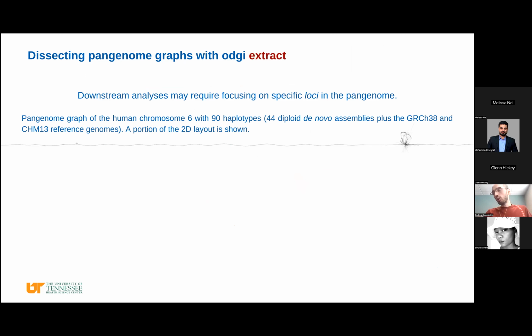We usually generate chromosome-specific pangenome graphs representing the whole chromosomes. Pggb is a very, I would say, general and simple approach. We take all the sequences without removing any regions, and we create a pangenome graph. So we usually don't filter out centromeres. On the right, this is a pangenome graph of human chromosome 6 with 90 haplotypes. This complex rectangle region is the centromeric region of chromosome 6.